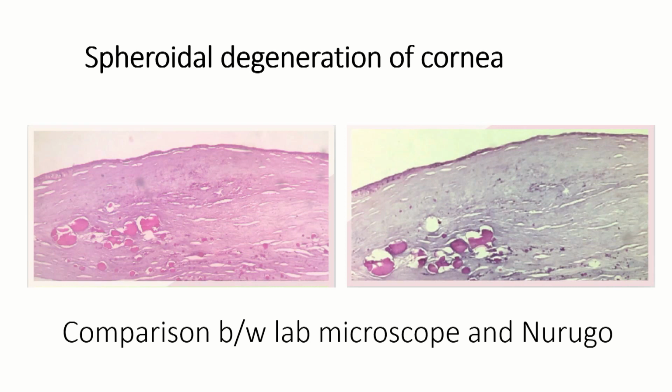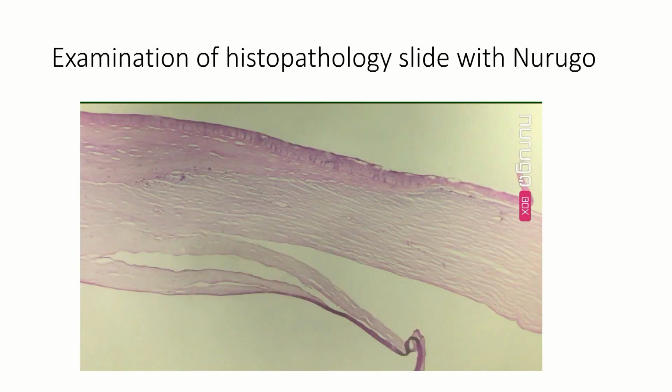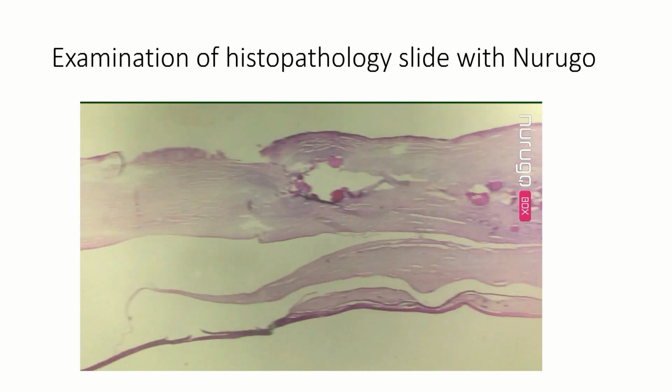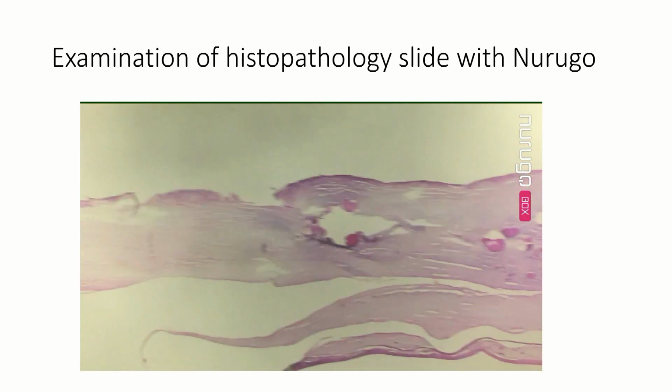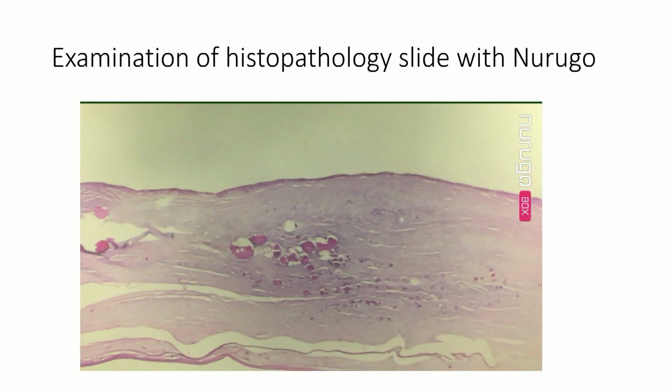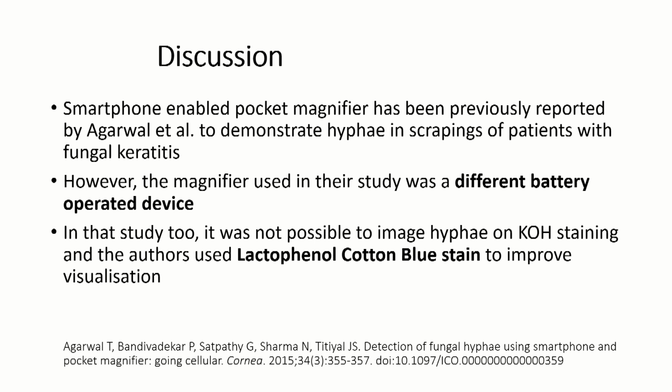the traditional lab microscope. With a little bit of learning curve, one can learn to scan through the various parts of the slide and focus on the areas of interest to capture images or make videos which can subsequently be shared. The use of smartphone enabled pocket magnifier has been earlier reported by Agarwal et al., who used a different battery enabled device to demonstrate hyphae in the fungal keratitis cases, and they used lactophenol cotton blue stain to improve visualization.